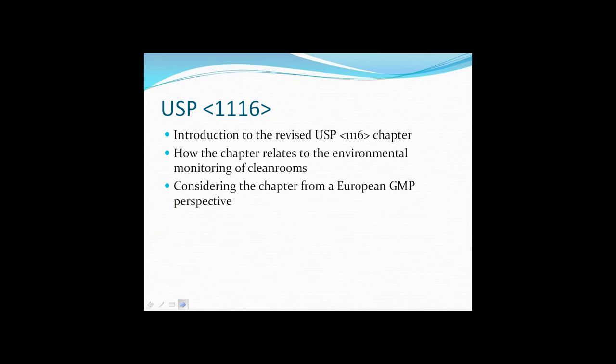This presentation is about the revised USP chapter which relates to the environmental monitoring of clean rooms for environments in which sterile products are filled. The webinar is designed to last for around 1 hour, and if there is time for any questions at the end we will take those, or alternatively we will ask people to email in their questions or discuss them on the FARMEG LinkedIn forum.